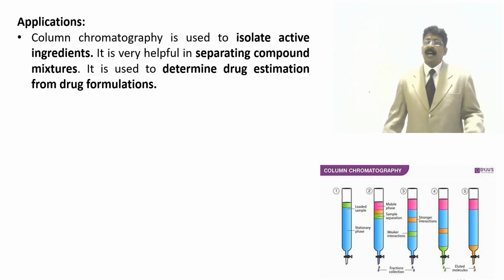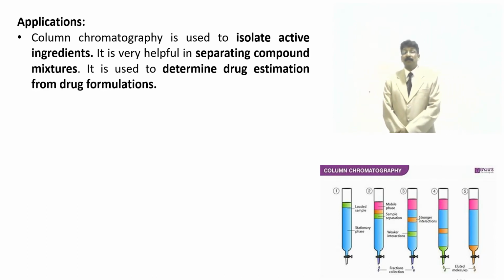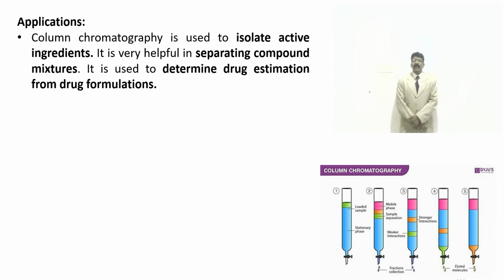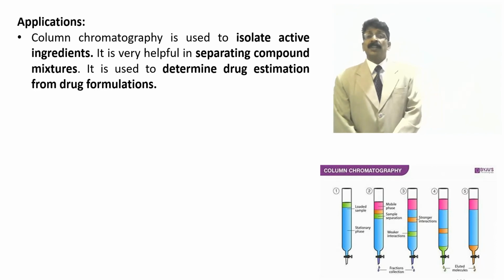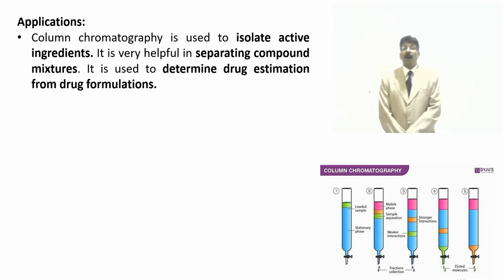But I don't want to, because there were some comments that it was very difficult and would be very tedious to do, but it is not very tedious. It can be done within 2-3 days or 4 days, a maximum of a week. We can have some separation by column chromatography. We can identify certain compounds by means of TLC.